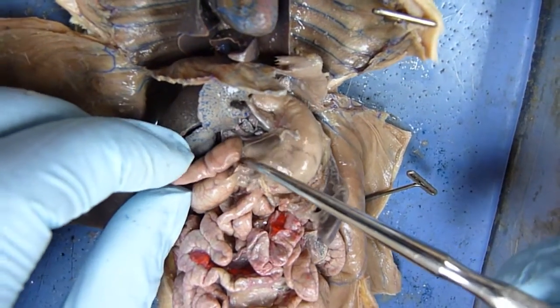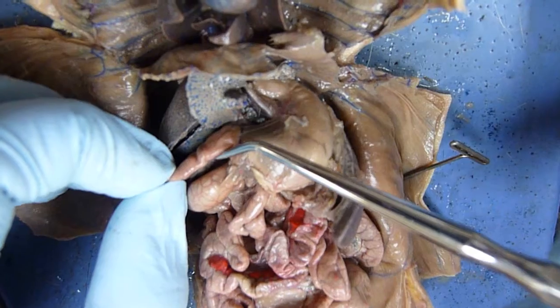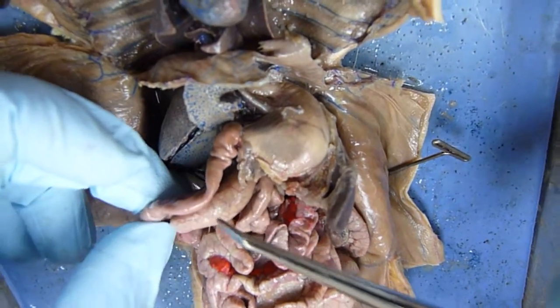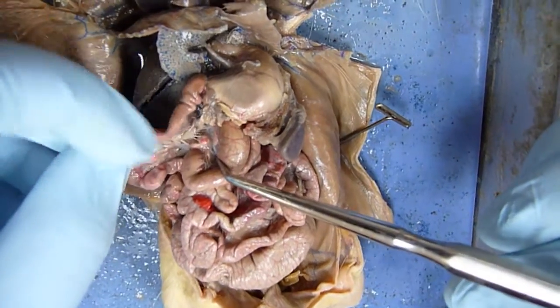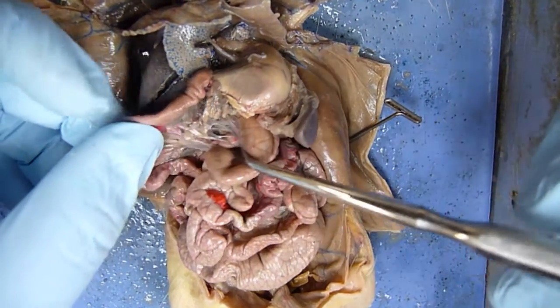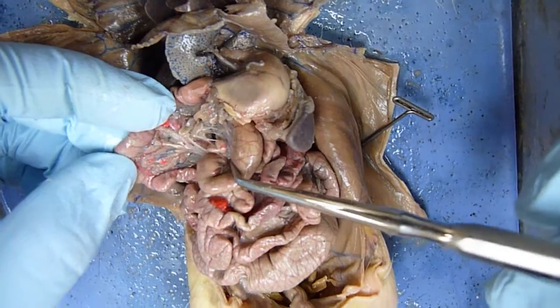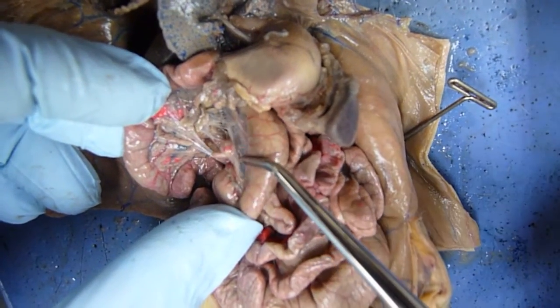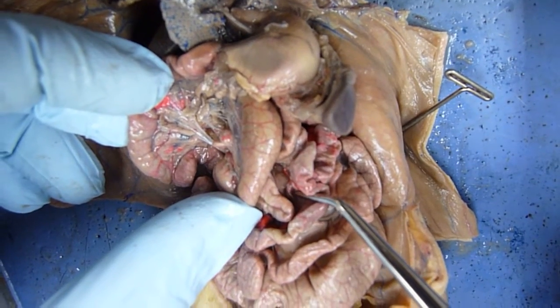Then it exits here into the very beginning of the intestines. This beginning portion of the intestines is called the duodenum. And within this first loop of the duodenum here, within this mesentery, you can see what looks like chewed up gum. That is actually the pancreas.